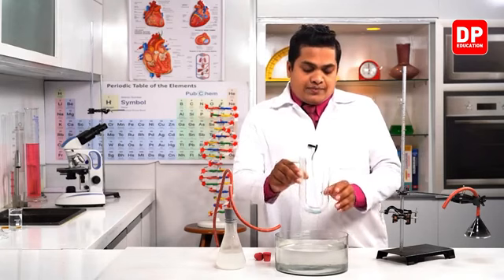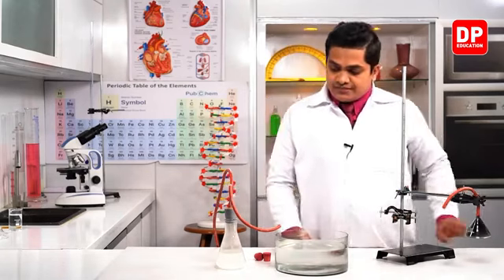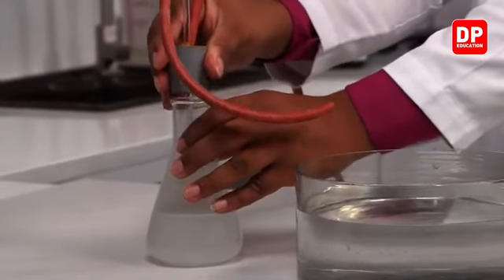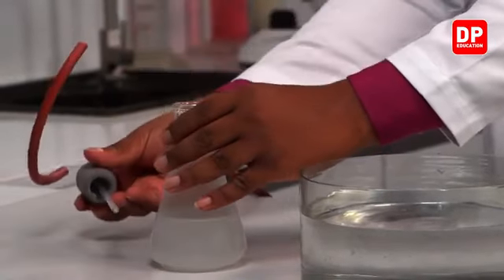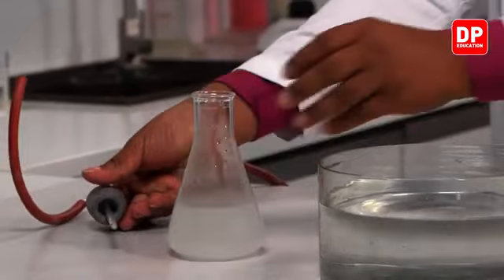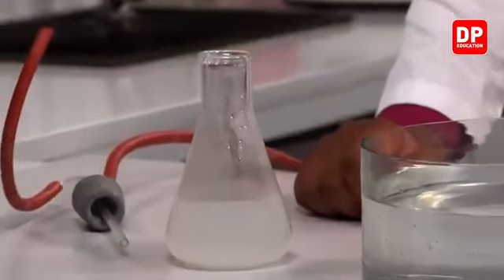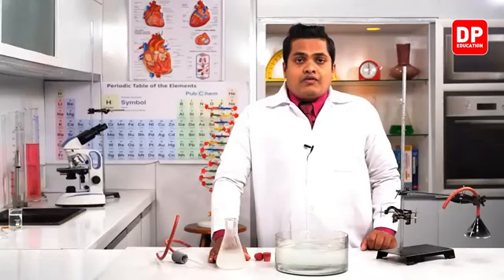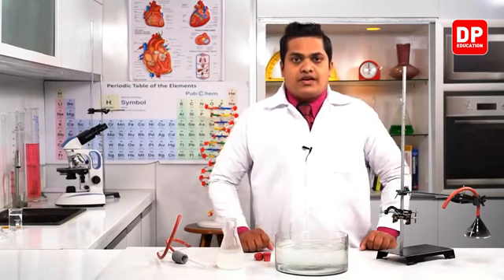Okay. So now let's come to the other vessel where we used the colorless lime water, right? Here you can observe that the colorless lime water has also turned a milky white color. This is because of carbon dioxide. From grade 6 onwards, you are going to study that.